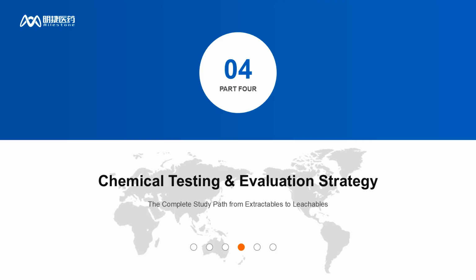Part 4, Chemical Testing and Evaluation Strategy. We've covered the why and the when. Now the how, the actual laboratory program. We'll walk through extractable studies, leachable studies, and simulation studies, and clarify exactly what each one can and cannot prove.